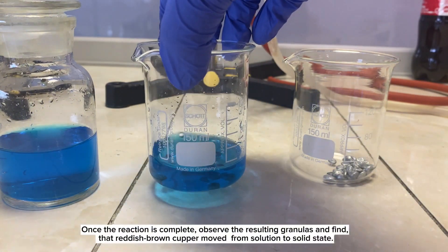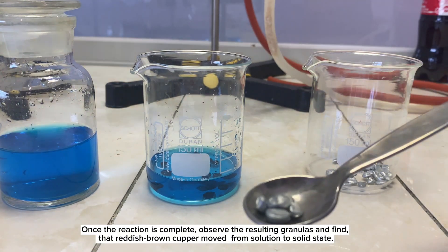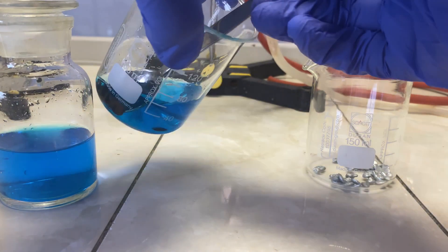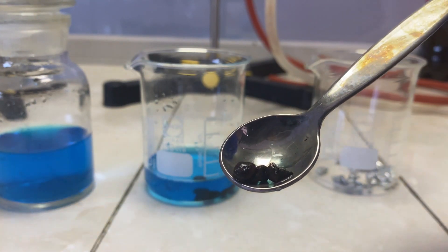Once the reaction is complete, observe the resulting granules and find that reddish-brown copper has moved from solution to solid state. Thank you.